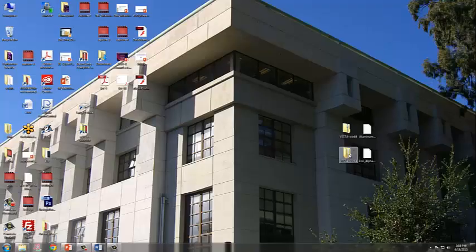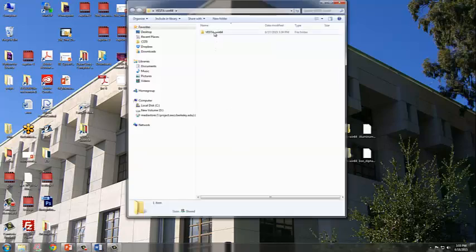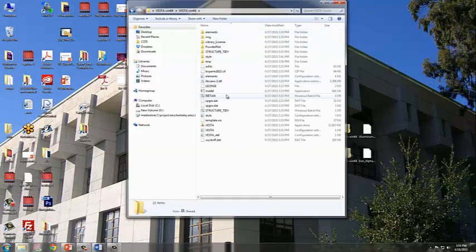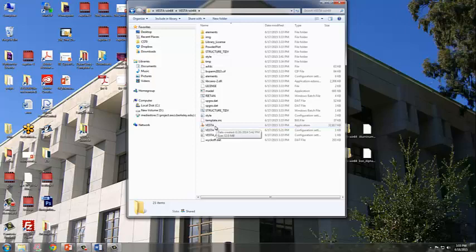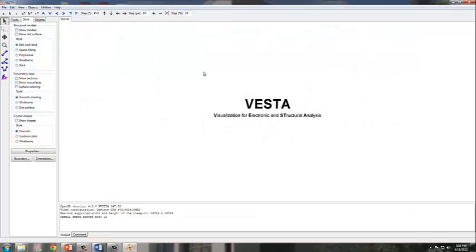Here I have my downloaded unpacked VESTA file. I will open the folder and then open the application, which is here. It's a .exe executable file. I'm going to double click on that, and here is the VESTA program.